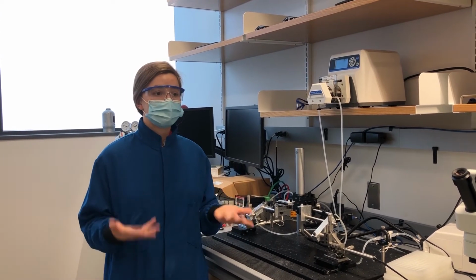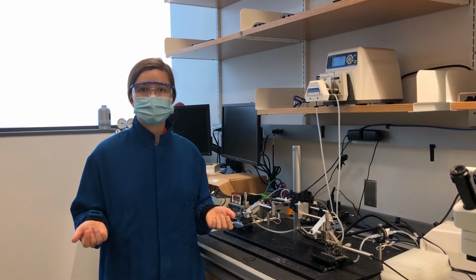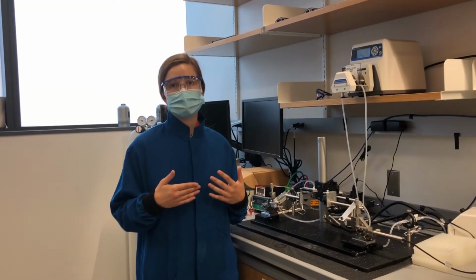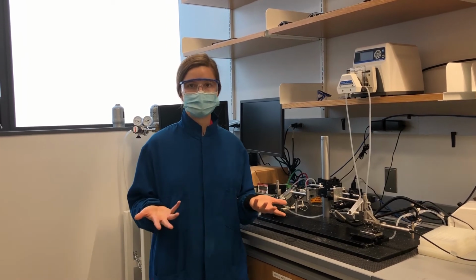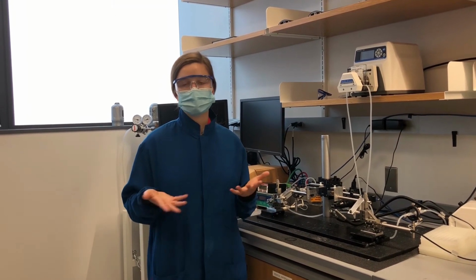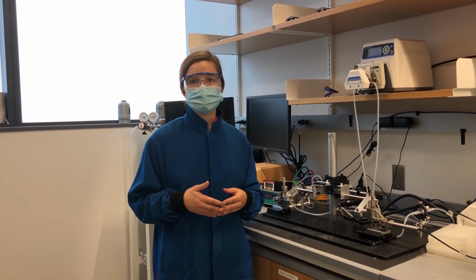And so we're seeking to characterize those changes mechanically, as well as through looking at the microstructure with things like histology, protein content, gene expression, in order to understand how these biological and mechanical changes take place. And by doing so, we hope to be able to inform clinicians on how to understand biomechanical factors and how that can play into their choices as far as treatment and prevention for their patients.